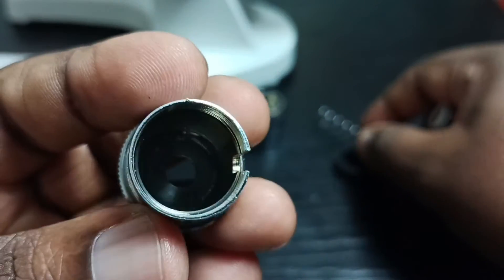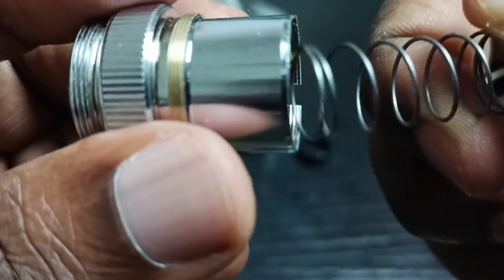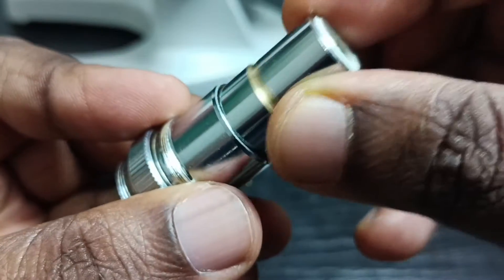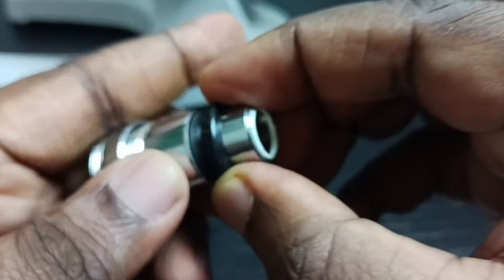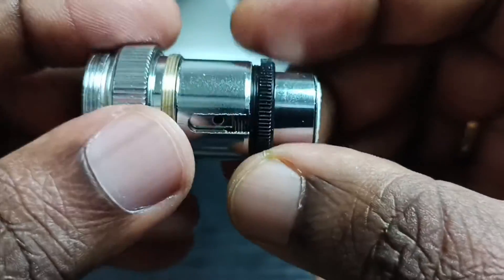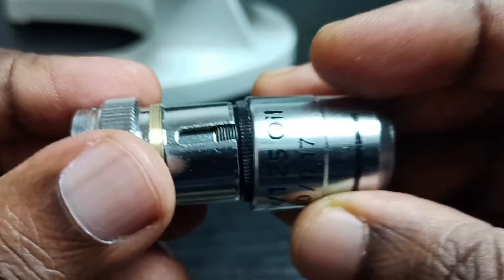After that, take this part, then put this spring inside, then put this lens, then this plastic, and we have to tie it like this. Then this is the final part.